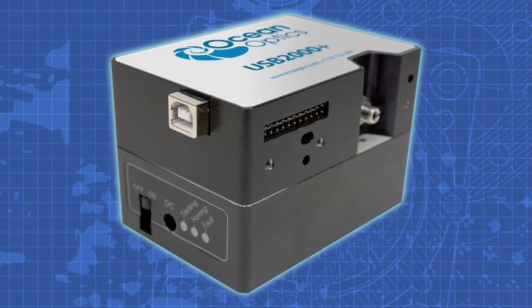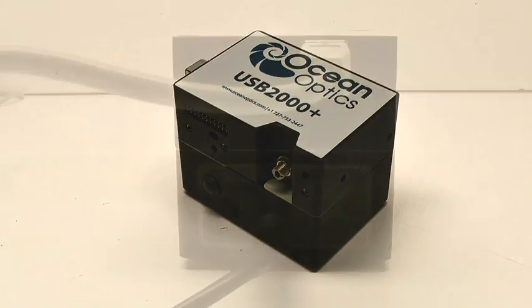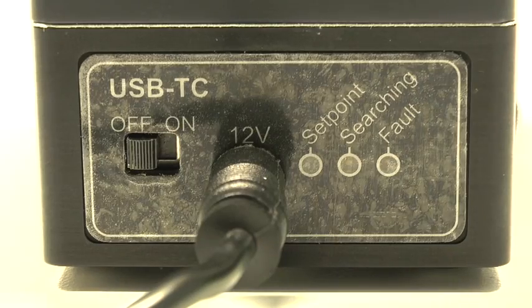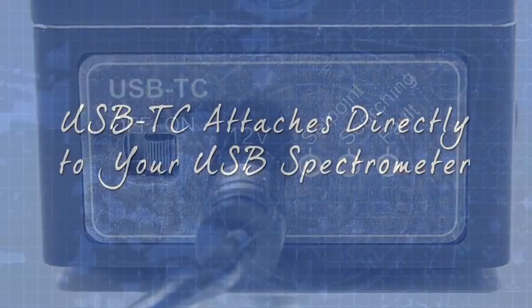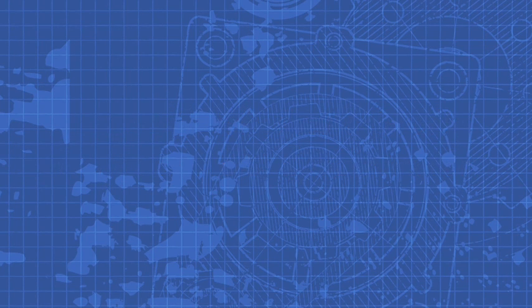For applications where temperature stability is critical, our USB spectrometers can be combined with the USB TC. This convenient temperature controller can be included with new spectrometer purchases or retrofitted onto your existing spectrometer.